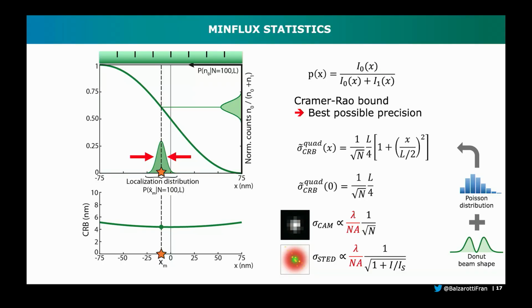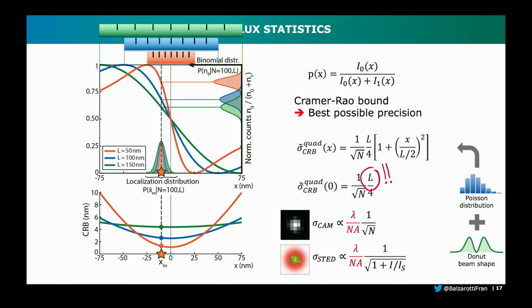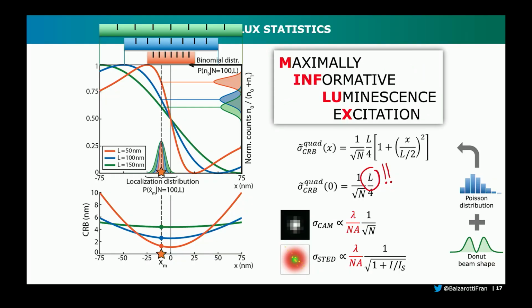How to interpret this? Well, I told you about this ruler. So if you shrink this parameter, it means that this ruler is smaller. And what it means is that the function that is mapping photon statistics to spatial localization gets sharper. And that's how you get the precision. And the Cramér-Rao bound goes in agreement with this shrinkage of distributions.